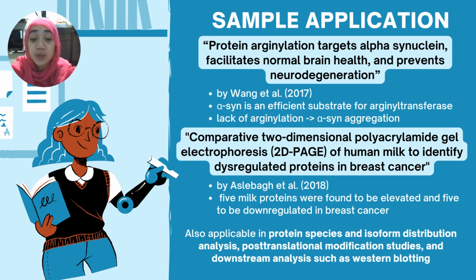Other applications of 2D SDS-PAGE include protein species and isoform distribution analysis, post-translational modification studies, and downstream analysis such as Western blotting.